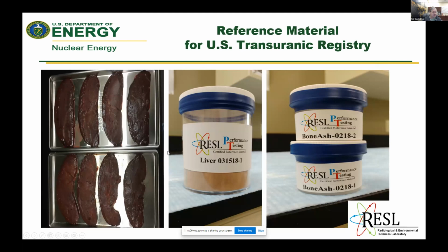If you're a radiation worker and you become highly contaminated and you want to donate your body to science, the United States Transuranic Registry will be happy to take you after you pass away and dissolve you up. Okay. And so before they go on to the regime of analysis for different things for models they're trying to make, we will make them some reference materials so that they can make sure and validate their methods. Here's one, there's a liver, for example, where we dehydrate it.